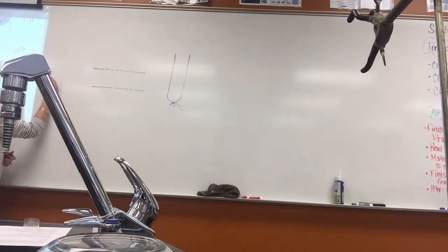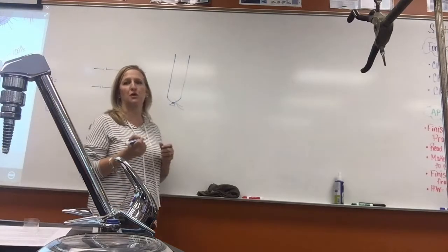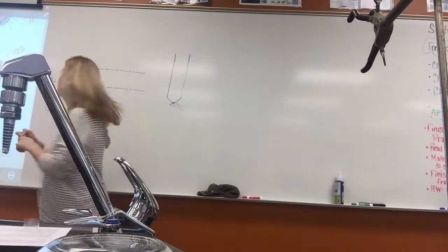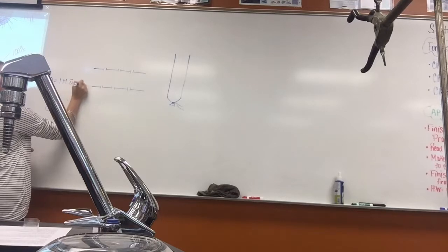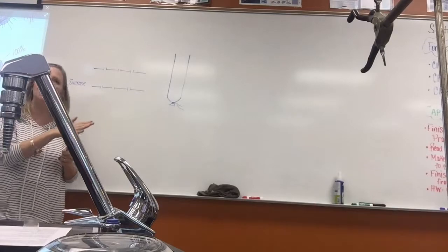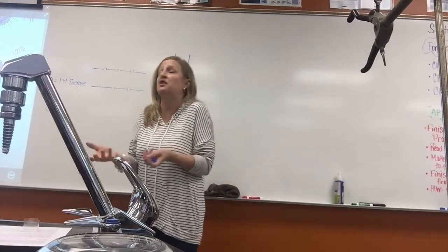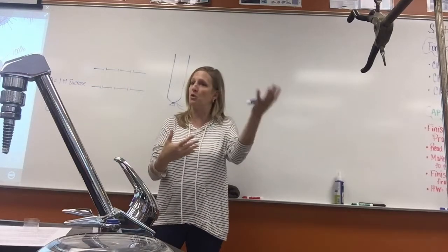Now it tells you that each group is going to have 3 setups and 3 solutions, or 3 cells, that you're going to make. What was in one of them? Sucrose, right? It said a 1 molar sucrose solution. What that's telling you is concentration. In the examples we just went over, I used percentages as information about concentration. Molarity is another concentration. Remember, it's moles per liter.